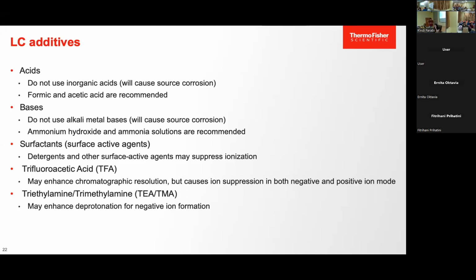After 10 injections, it becomes this low without changing anything. You may clean out the system and it goes back, but after a while it drops again. This is called ion suppression, and it has to do with TFA. Okay. TEA and TMA are used to form negative ions. This is for deprotonation.